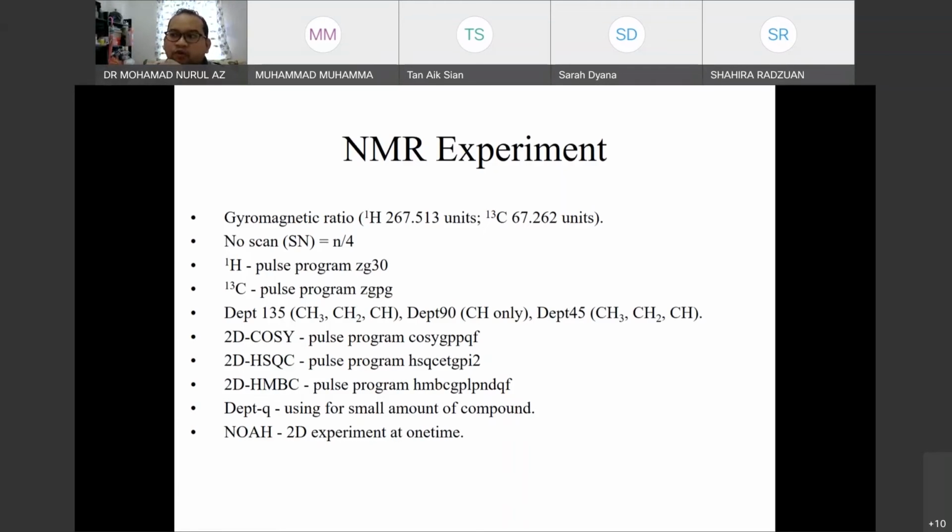For carbon, they measure all the carbon peaks from quaternary to CH3. For the DEPT, they will measure CH, so you can eliminate which signal represents CH. All this information will help you a lot. For the COSY, they will measure the neighboring protons, proton-proton interactions, neighboring only.